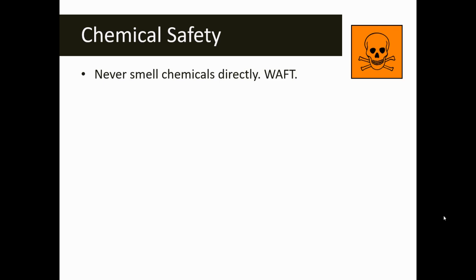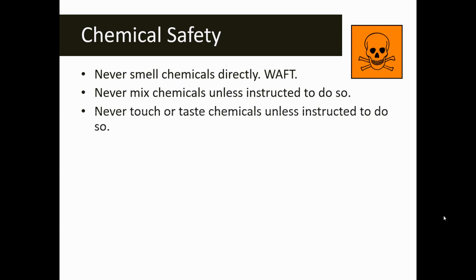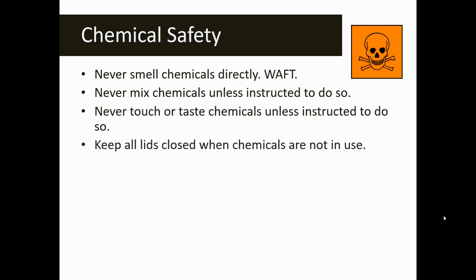If you're ever asked to observe the smell of a chemical, never smell it directly — you always want to waft by moving the odor towards your nose with a waving motion of the hand. Never mix chemicals unless you're instructed to do so — this will be outlined in your lab instructions. Never touch or taste chemicals unless instructed to do so. Make sure that all lids are kept closed — if you remove something from a container and add it, put the lid back on when the chemicals are not being used.